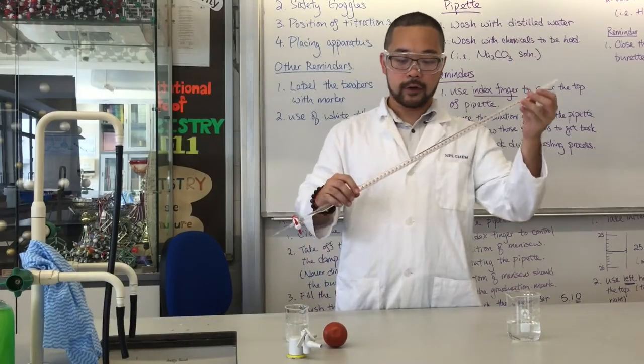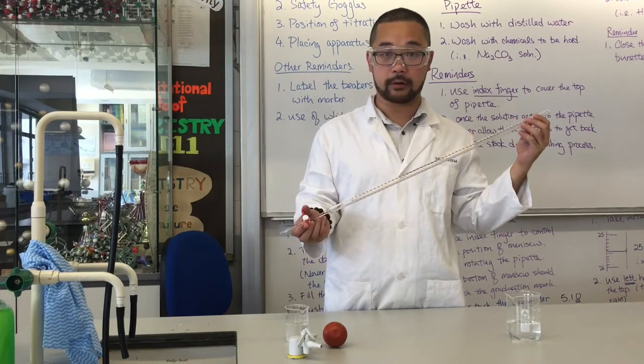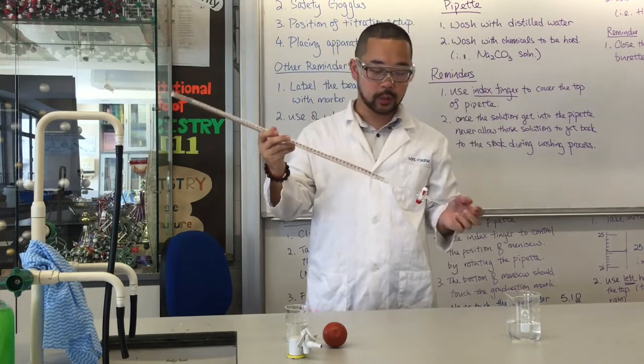Clean a burette. For a burette, remember it's a little different from a pipette. You have a tap right here. Whenever you fill the burette, make sure this one is closed. Again, this has two openings.